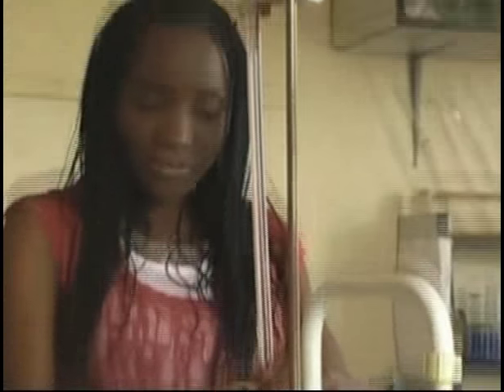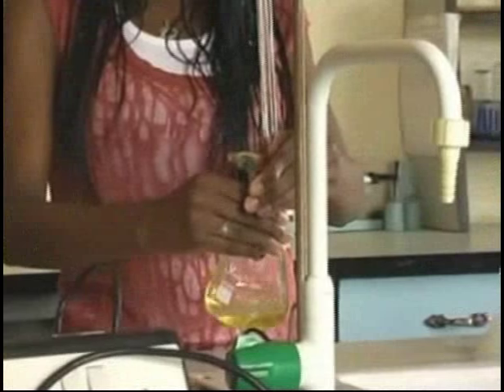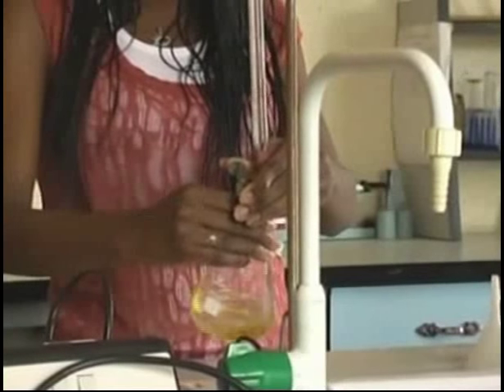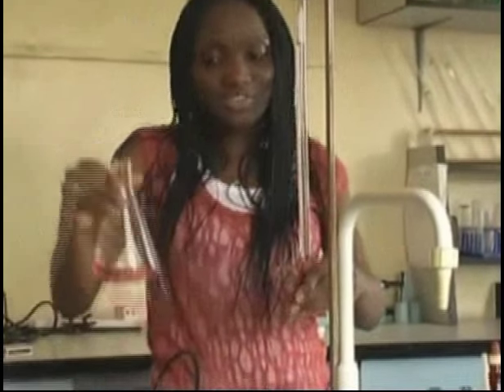I know that I'm approaching the end point when I see some drops of pink. Now that it's almost pink, I only need to add 1 more drop to make it completely pink. I'm going to check my burette to see how much acid I have used. It has now been neutralized. As you can see, the solution has turned pink. And I used 21.5 cm cubed of acid, and I'm going to record that.